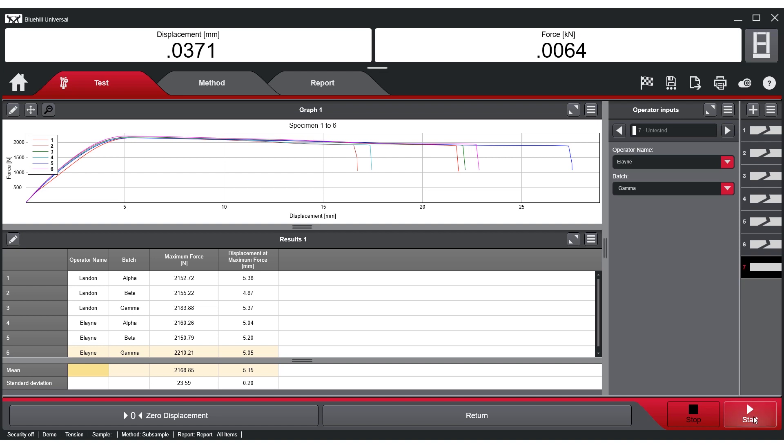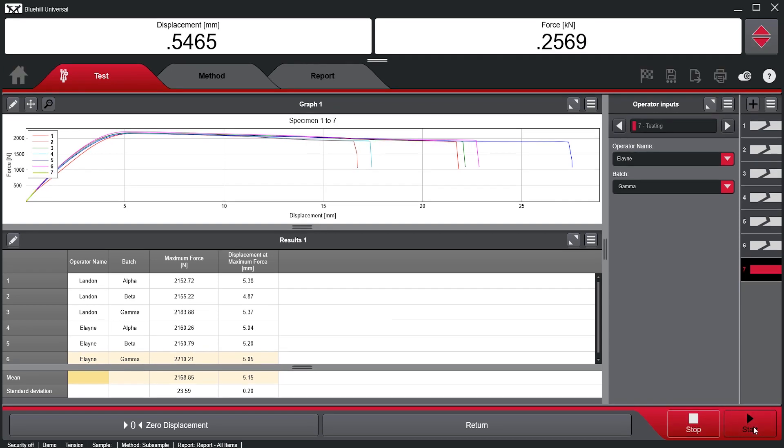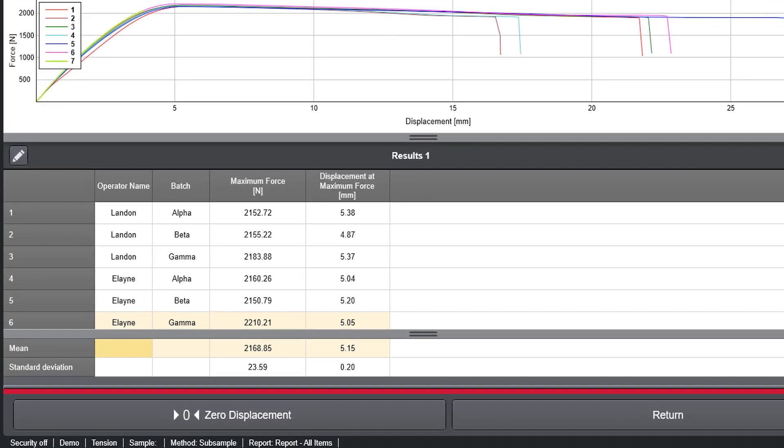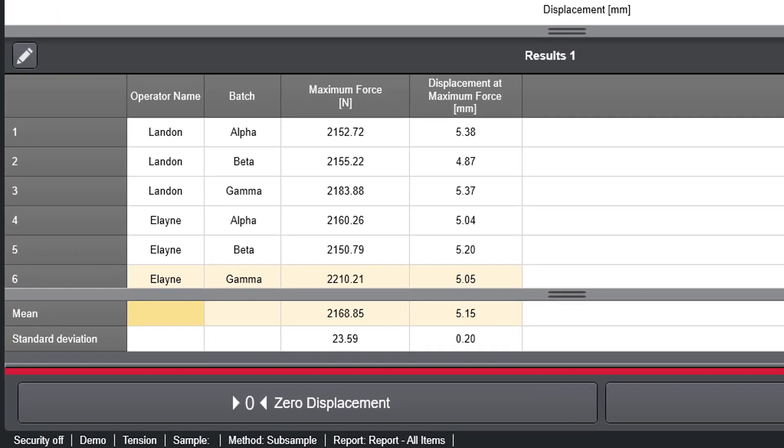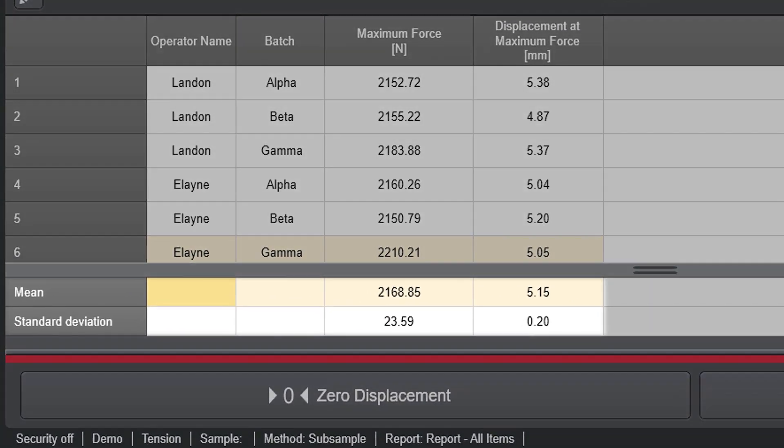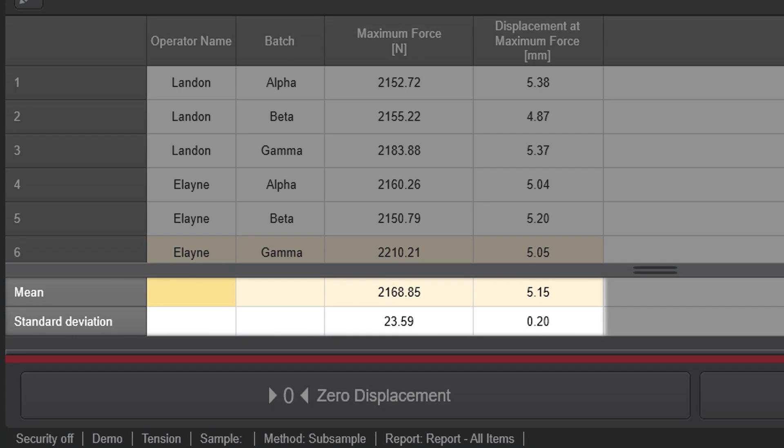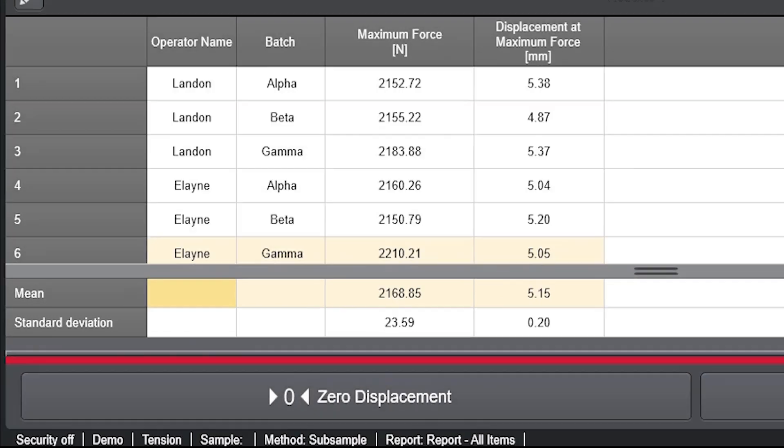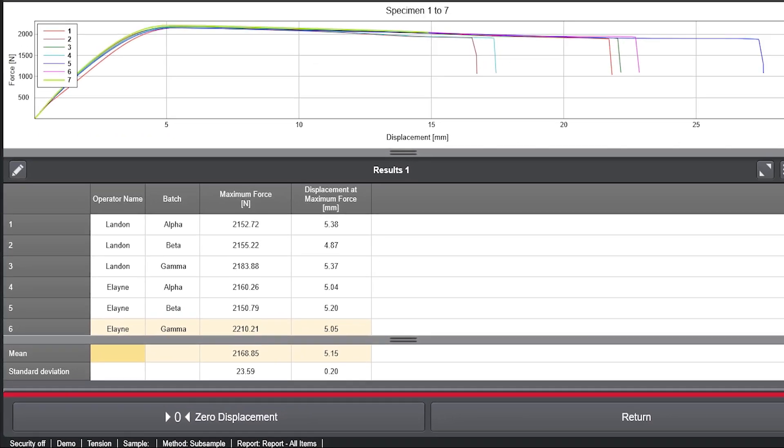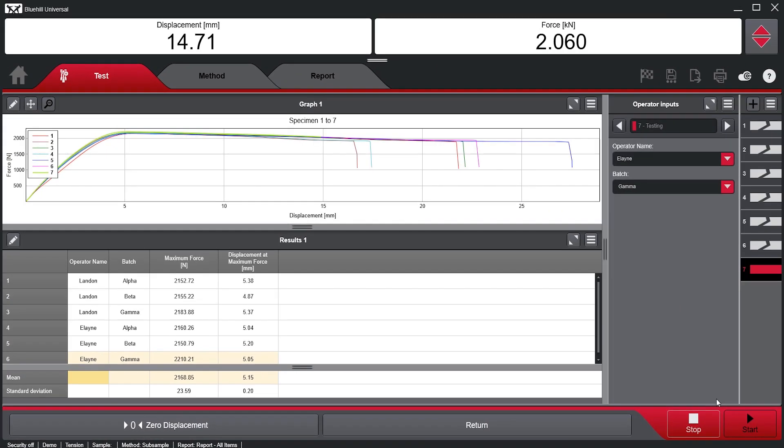Here we have a sample consisting of different specimen types, in this case, three different batches. On the bottom of the results table, we see the sample statistics. In instances where the specimens are all homogeneous, the sample statistics can provide sufficient analytical insight into the repeatability and trends of the data.